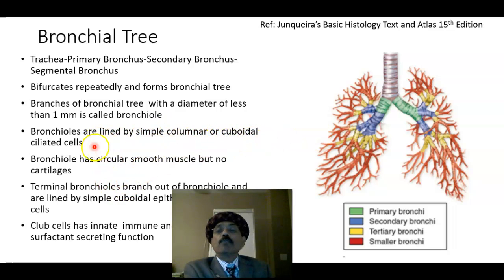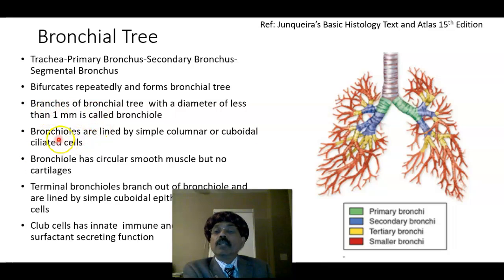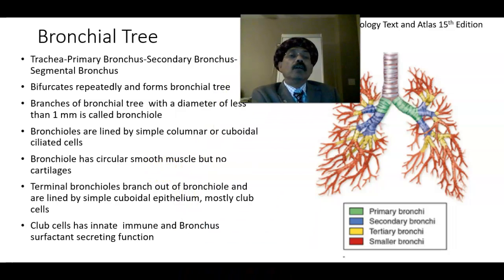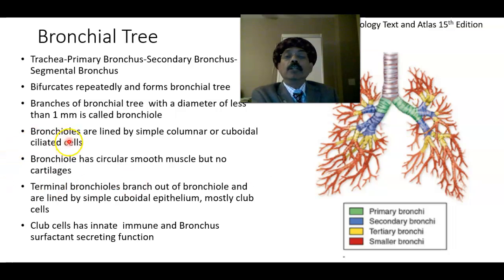Bronchioles are lined by simple columnar or cuboidal ciliated cells. The trachea, primary bronchus, secondary bronchus, and tertiary bronchus are lined by pseudostratified ciliated columnar epithelium. In the bronchioles we get simple columnar or cuboidal ciliated cells. Bronchioles have circular smooth muscle but no cartilages. In the trachea through to the tertiary bronchus, cartilages are present, but at the level of the bronchiole there is no cartilage.